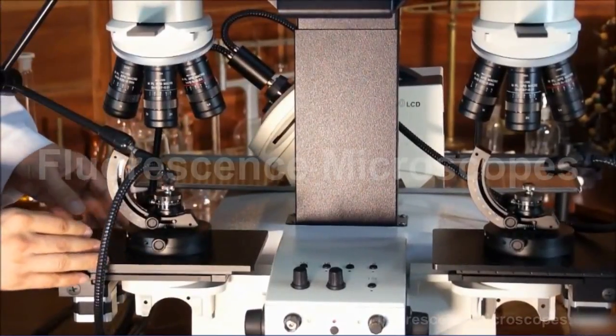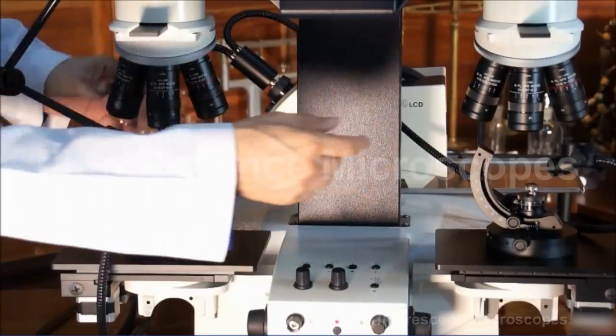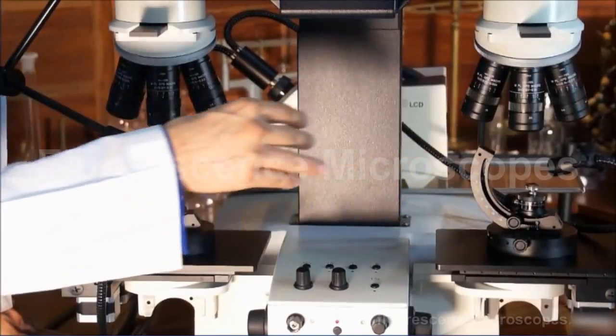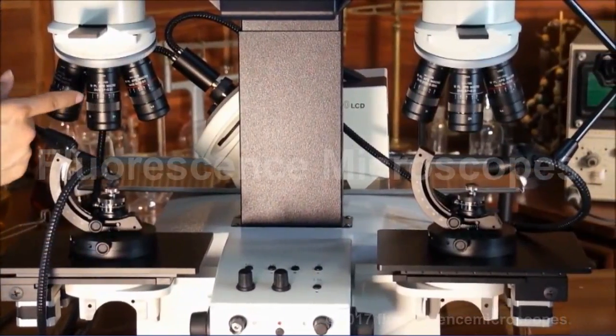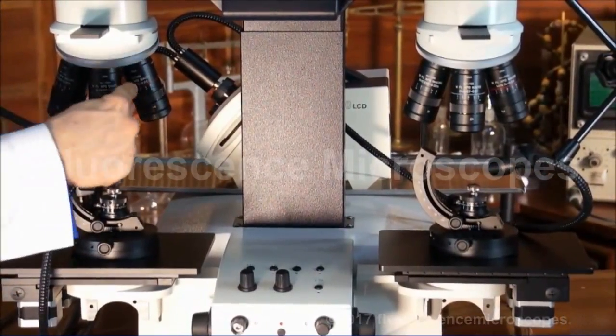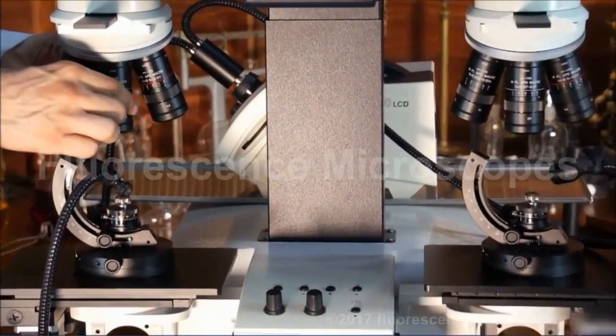This particular unit is configured with three of the Planapo macro objective lenses, three on each side. This particular one is configured with one, two, and four power. All of these have iris diaphragms.